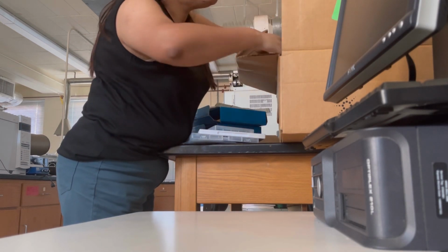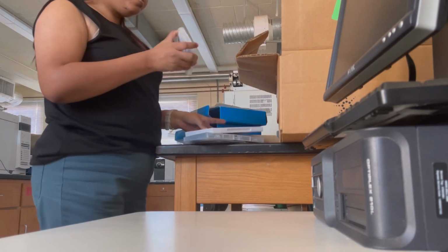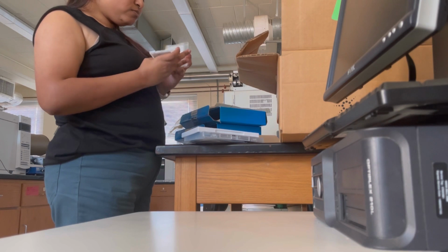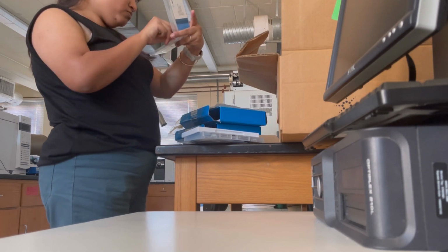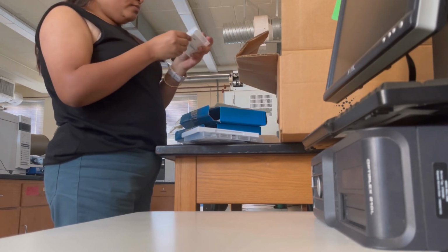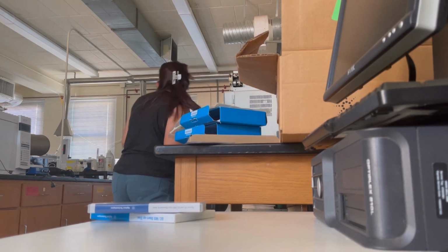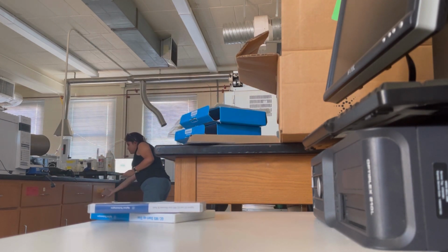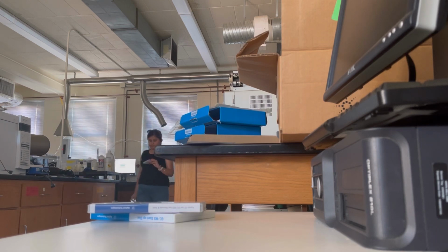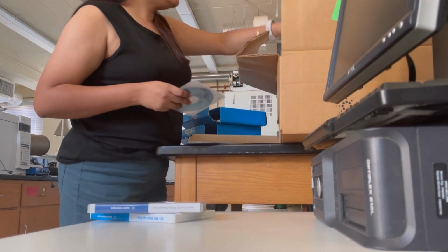So one of the quick things that I wanted to do was check the signal from my samples against the reference standard that I was running, and see if everything was okay at the integration level. In order to do that, I went to the lab to get the qualitative software, and since I was doing all the analysis on my home PC, I wanted to get that software installed on my home PC.